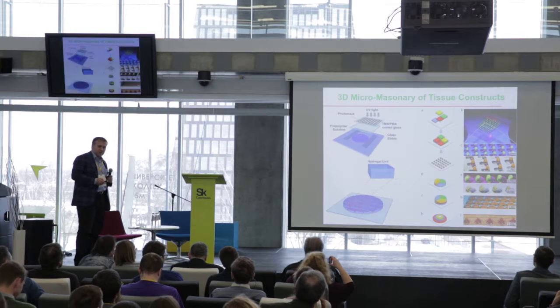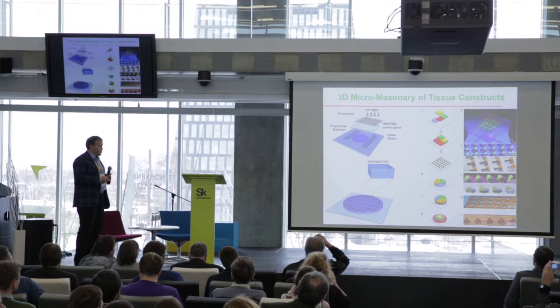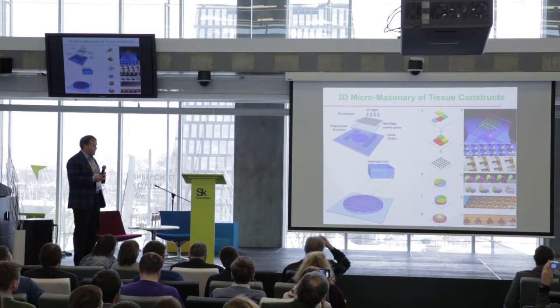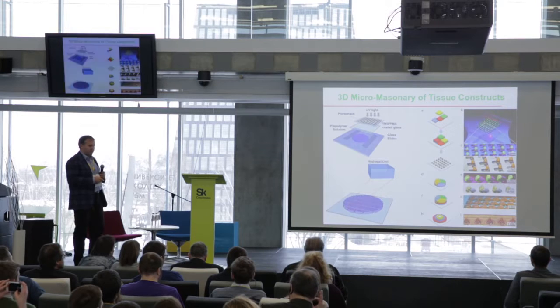Spheroids also fit into this description because spheroids are also, in a sense, micro-constructs, and if you culture them long enough, as the earlier speakers discussed, they can become tissue units, which you can then assemble with bioprinting, like 3D Bio does, or you can build more complex architectures.